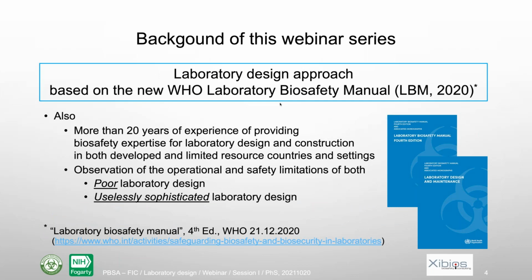So the basis for this webinar series is the new Laboratory Biosafety Manual by WHO that was published at the end of last year. Also, of course, I have some experience in laboratory design, both in developed countries, Belgium, Europe, and some other parts, but also in lower resource countries.